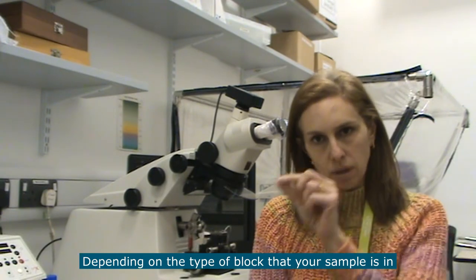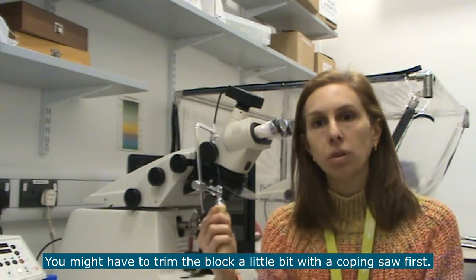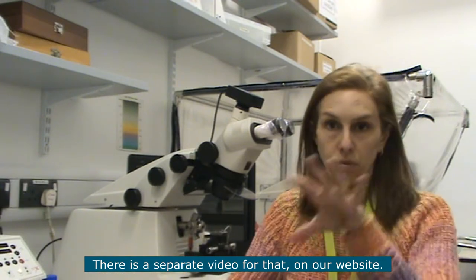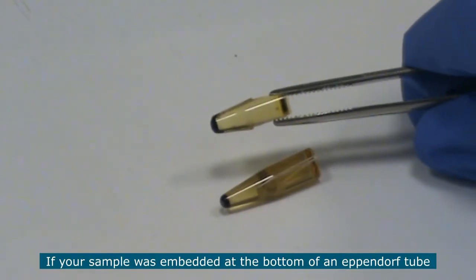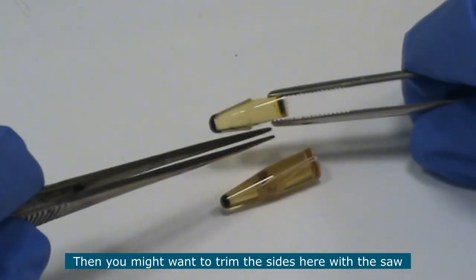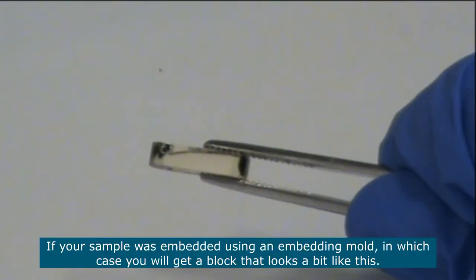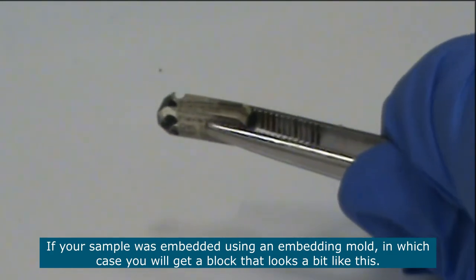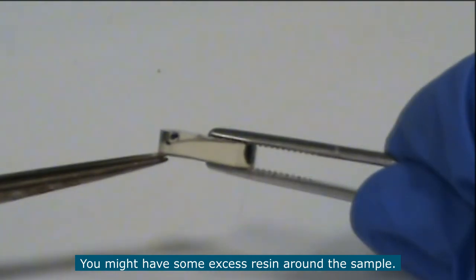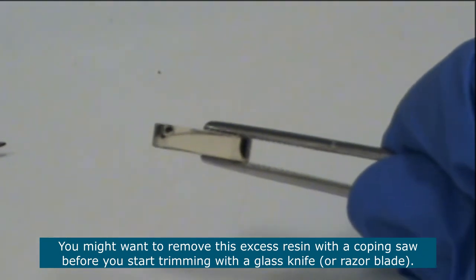Depending on the type of block that your sample is in, you might have to trim the block a little bit using a coping saw before you do the trimming with a glass knife. There is a separate video showing you how to do the trimming with this saw. If your sample was embedded at the bottom of an Eppendorf tube, you might want to trim the sides with the saw so that the block fits better in the chuck for sectioning. If your sample was embedded using an embedding mould, you might get some excess resin around the sample, which you may want to remove using the coping saw before trimming with a glass knife or a razor blade.